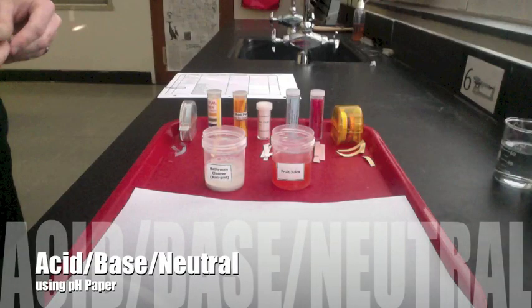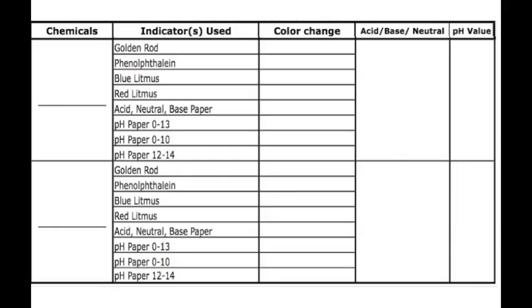To determine if something is an acid, a base, or neutral, we need an indicator, which will turn a different color when in contact with an acid or a base. There are several indicators we can use, like goldenrod, phenolphthalein, litmus paper, acid-base neutral paper, and pH paper.